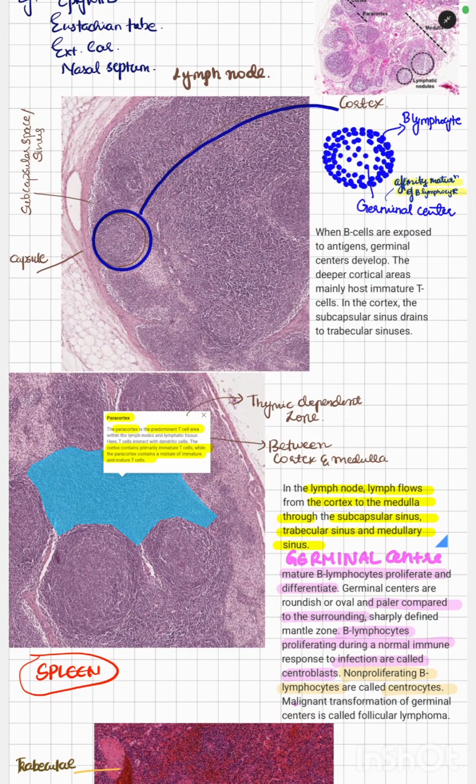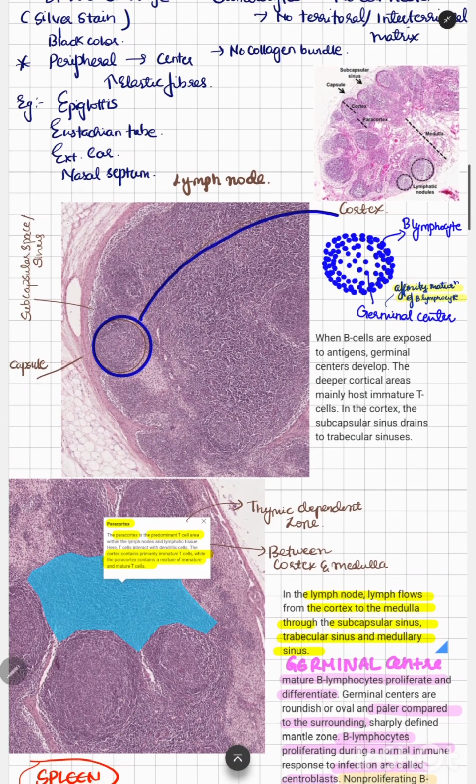Welcome to part 2 of histology images, where I'll be discussing the most important histology slides for NEET PG, INI-CET and FMGE. So first thing is about lymph node. Lymph node, it's very easy to identify.